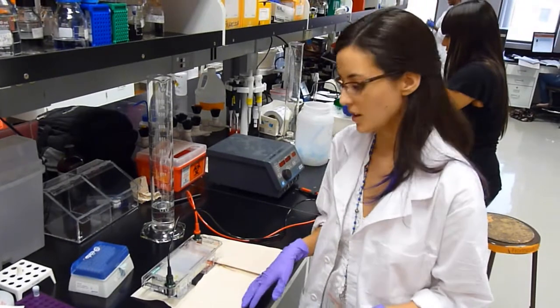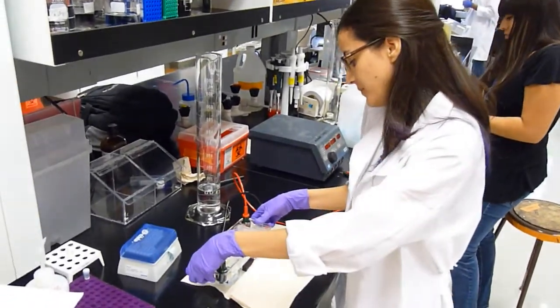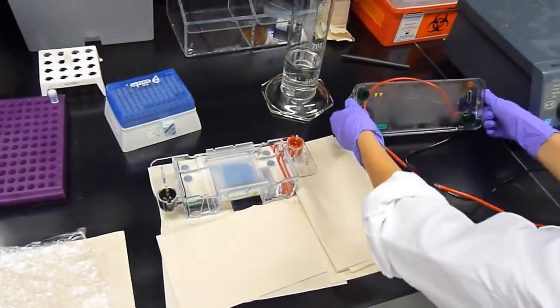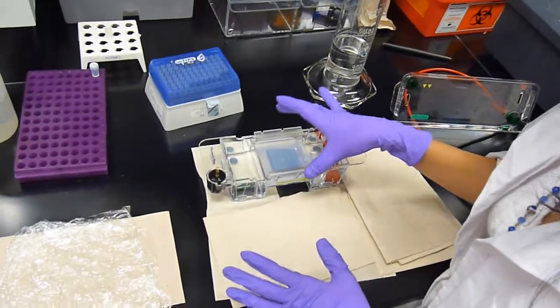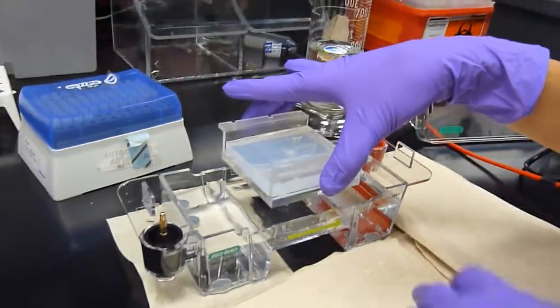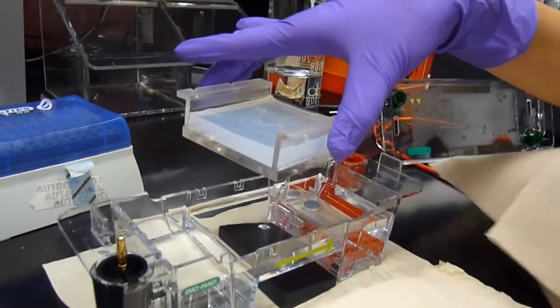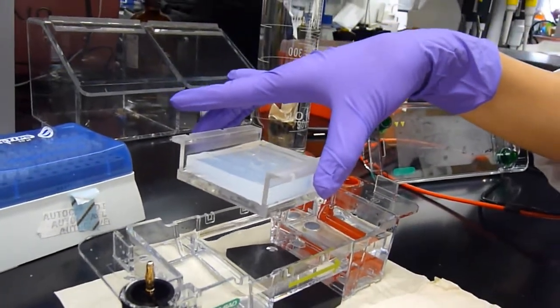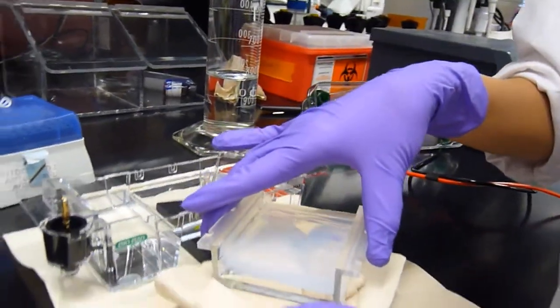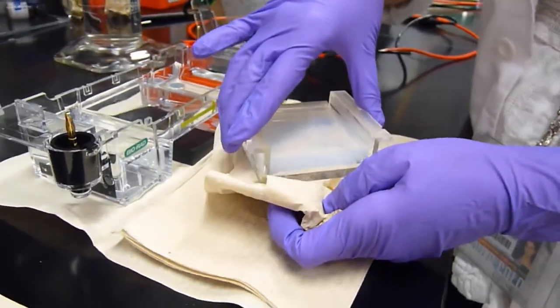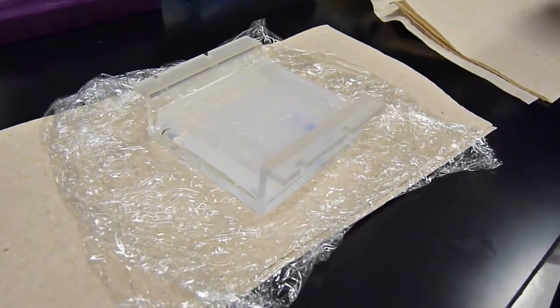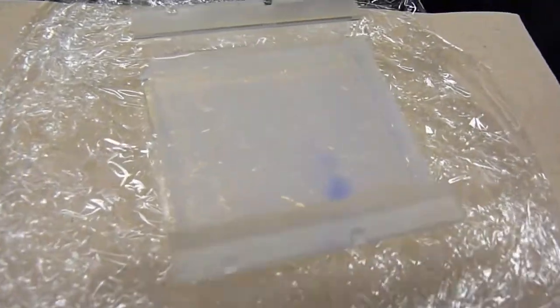So our gel has finished running. I'm just going to take it out of the tank. Make sure to unplug the lead before doing this, or else you might get electrocuted. Now carefully take out your gel. I'm just going to dry it off. But remember that all of this is contaminated with ethidium bromide, so you need to be careful. I'm going to transfer it to this plastic wrap. And we're going to take it downstairs for our visualization.